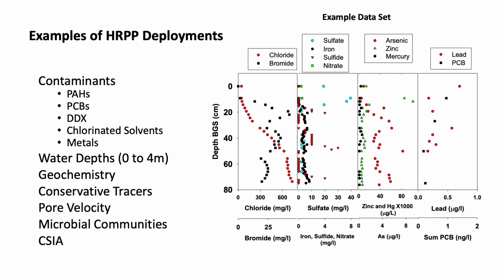Again, there is much more detail on the results of these deployments for each of the deployment sites available in other presentations and publications, but the samplers do have a wide utility and can provide very high resolution data, which is conducive to modeling studies and for understanding the fate and transport and long-term fate of the contaminants in a variety of sites.